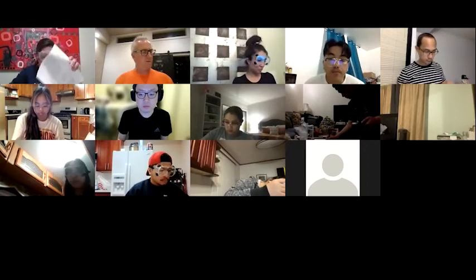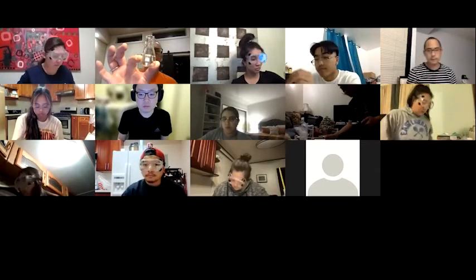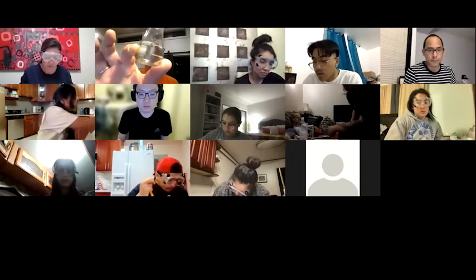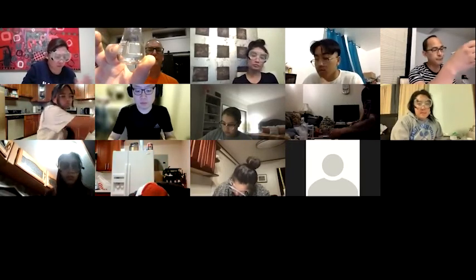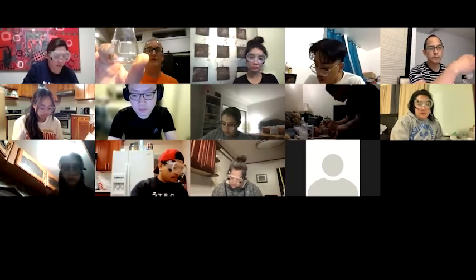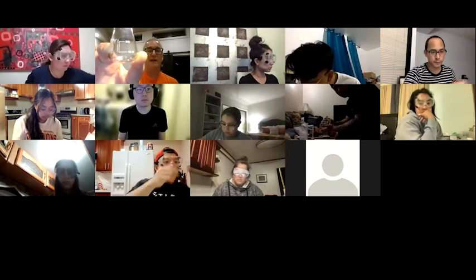But here on the 25 mil flask, you can see there's only two things that are written on it, 12.5 and 25. So that's basically going to be your intervals. So you can see that the uncertainty associated with that measurement is going to be pretty high.